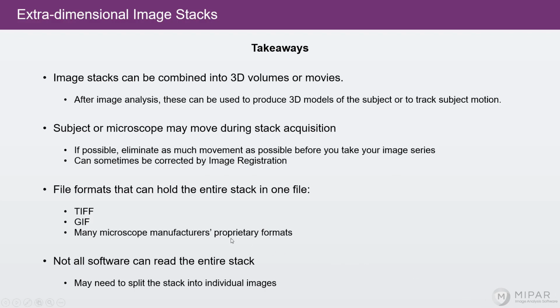Many microscope manufacturers have proprietary formats that can hold this sort of multidimensional image. Also note that not all software can process the entire stack. Some can, some can't. If not, you'll need to split the stack up into individual images and then process each one individually.